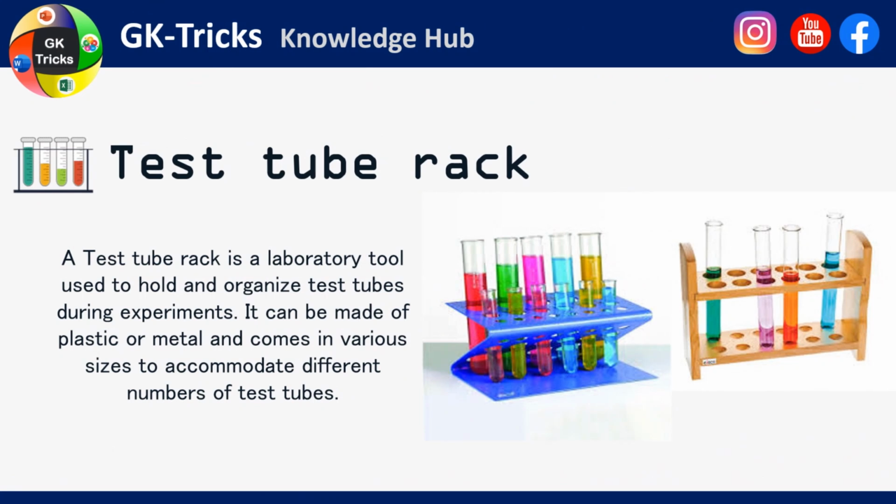Test tube rack. A test tube rack is a laboratory tool used to hold and organize test tubes during experiments. It can be made of plastic or metal and comes in various sizes to accommodate different numbers of test tubes.